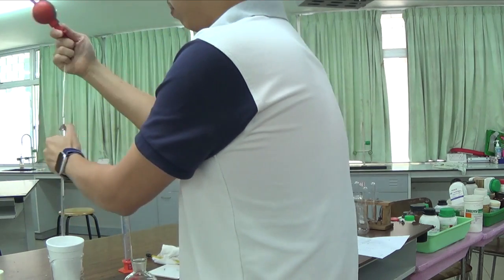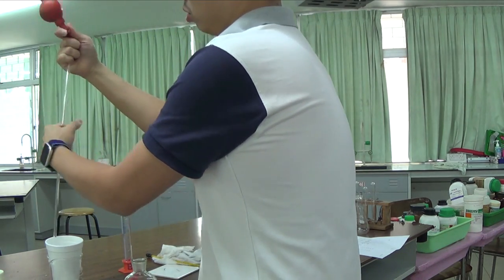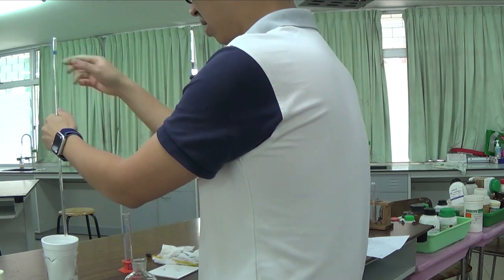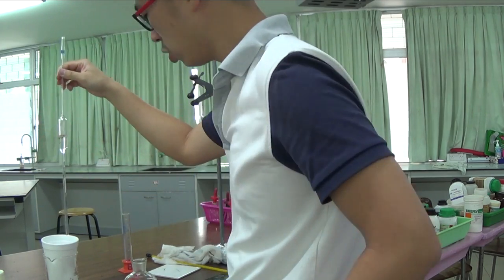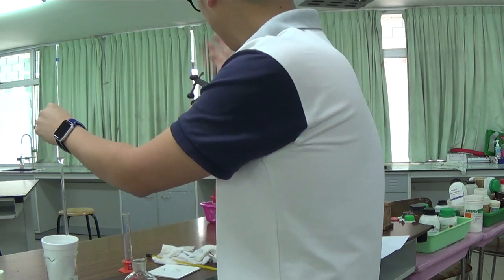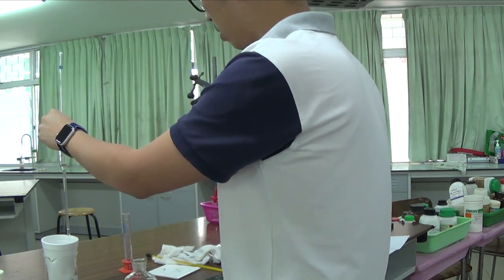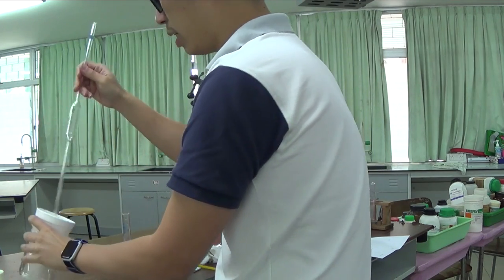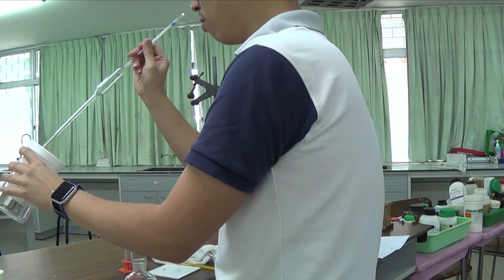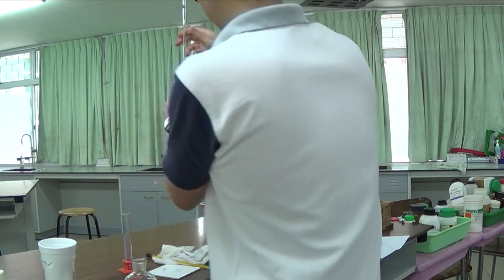Okay, so I check it in today. Slowly place your pipette fillers so that you don't break the glassware. Gravity does its job. Of course, then we need to put the thermometer in there, and we need to run whatever volume we need in the burette into the measuring cylinder and make it up to 25 cm³ before we mix the solution together.